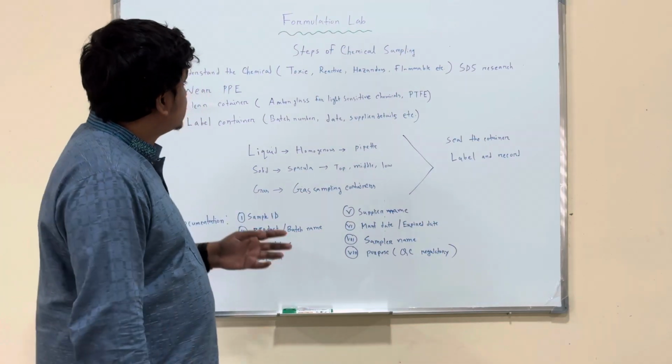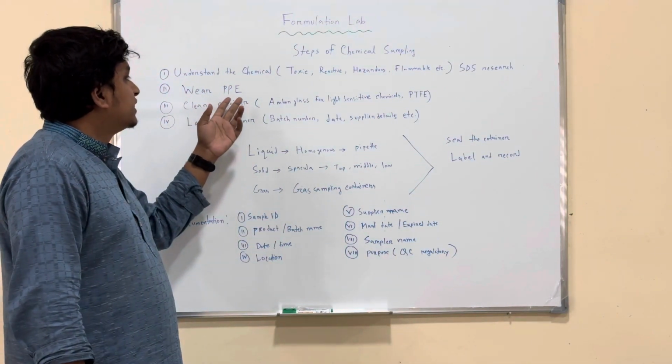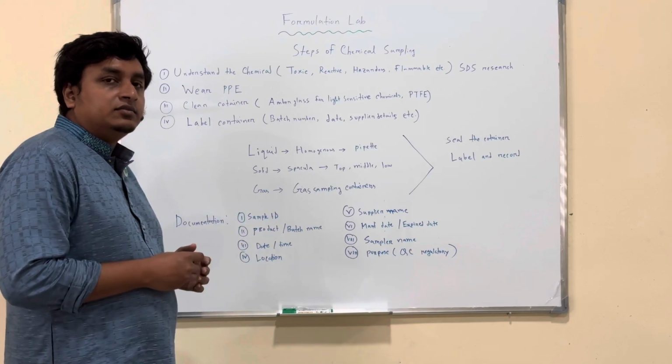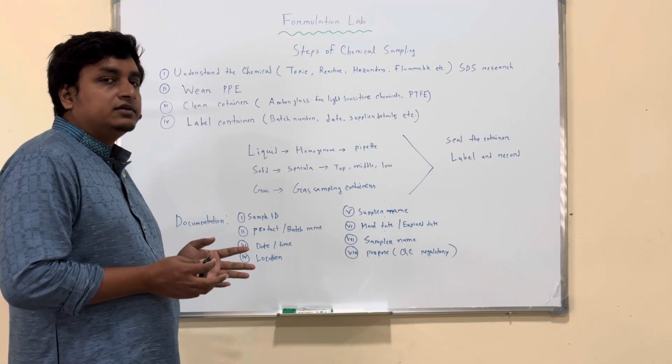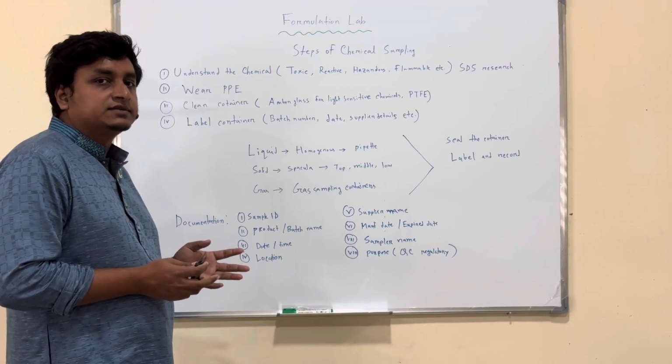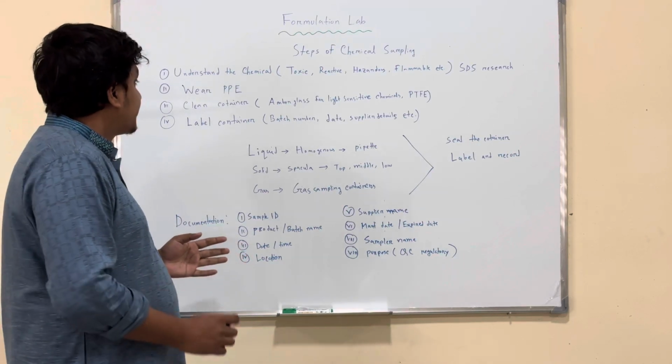So secondly, we have to wear all kinds of PPE, that means personal protective equipment, like hand gloves, goggles, face mask, etc.